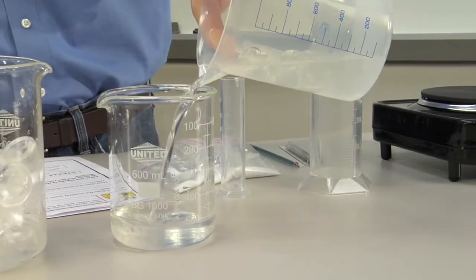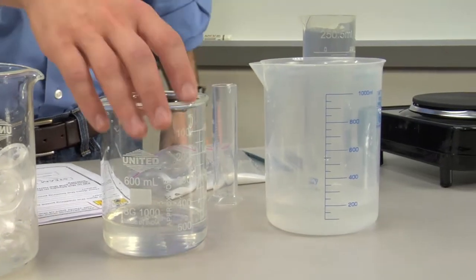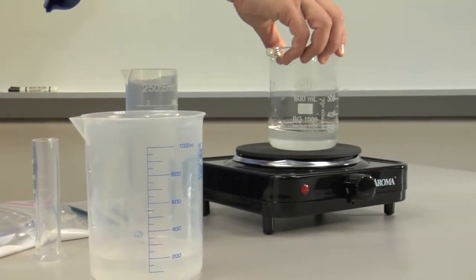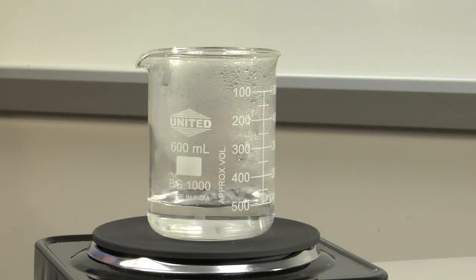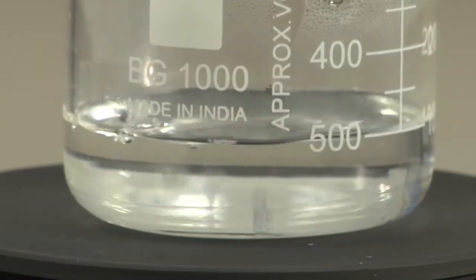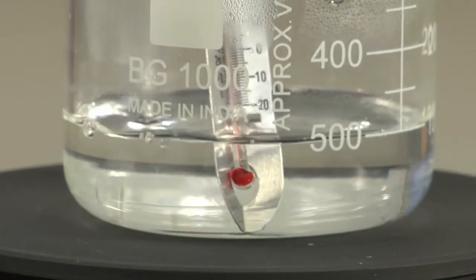Next, pour 200 milliliters of salt water into a beaker. Place the beaker on the hot plate and heat. At the boiling point, record the temperature of the beaker's contents.